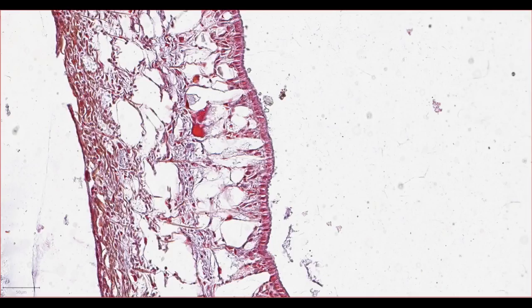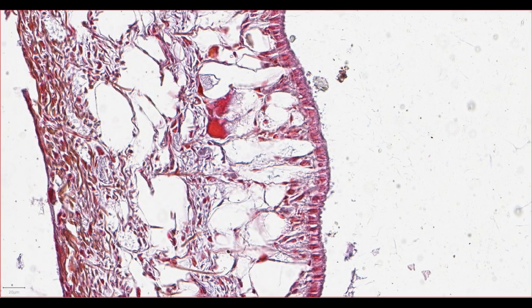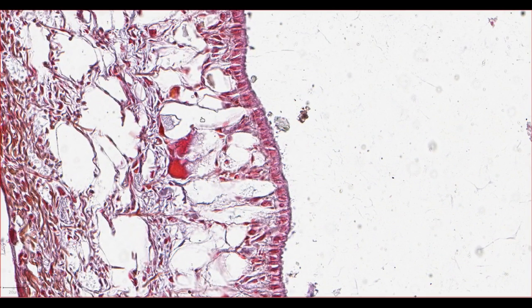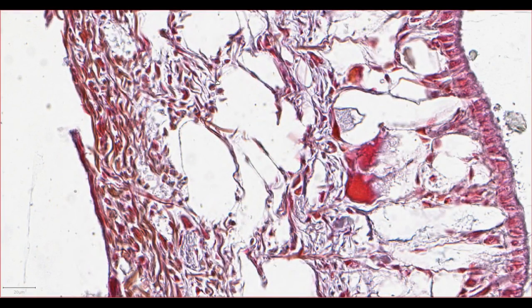Holding everything together, the snail has an integumentary system as well. As in other animals, there is an epidermis, formed by this single layer of cells here, underneath which we can see these huge mucus-filled cells, which will be keeping the skin moist. So, this whole structure here is one cell with a nucleus down here, and the mucoid content, we can see it's emptying out onto the skin surface here.